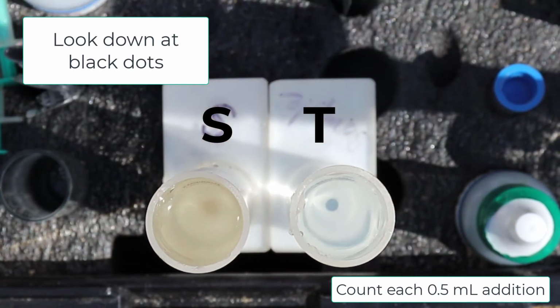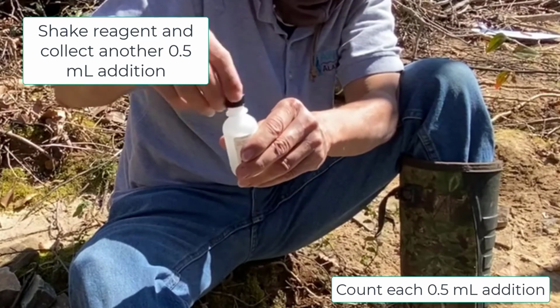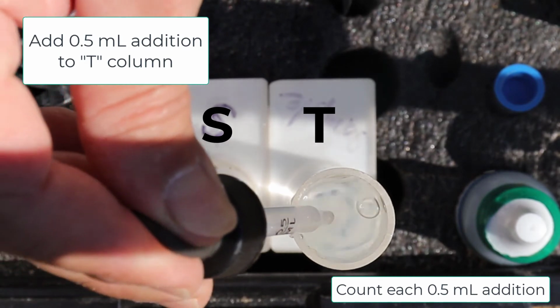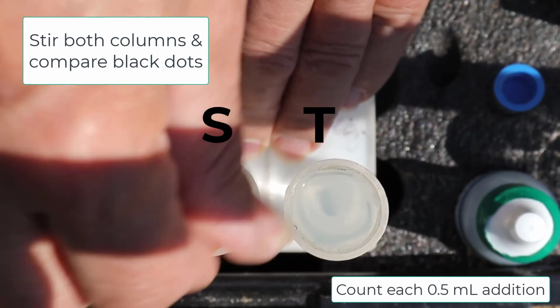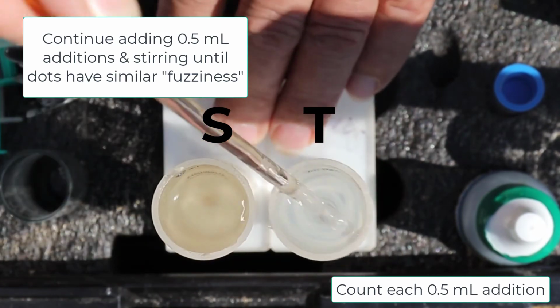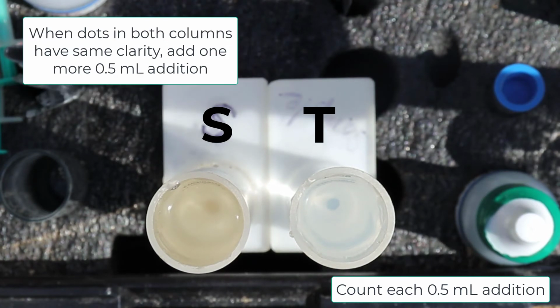If the dot at the bottom of the T column is less fuzzy than the dot at the bottom of the S column, shake the standard turbidity reagent and collect another 0.5 milliliters in the dropper. Add the entire 0.5 milliliter to the T column. Stir both columns and observe the black dots. Continue this process of adding 0.5 milliliters of the reagent to the T column until the dots in both columns appear to have the same fuzziness or clarity. You will need to know how many additions you add to the control column, so don't forget to count.